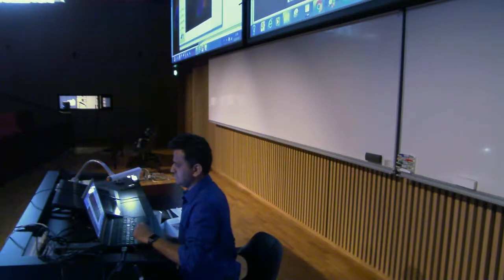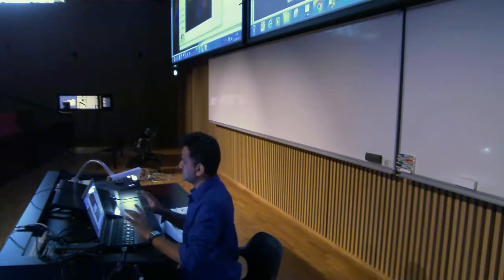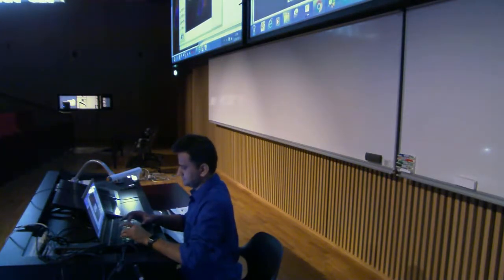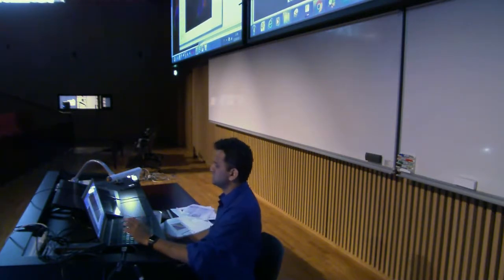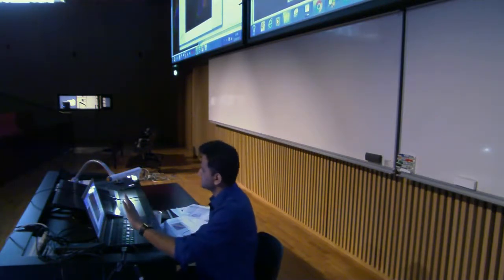So the green one, and then maybe create a new class. You can rename it also. Class 3, and I say green one here. Then you say train classifier. Sometimes it just gives a rubbish result, so you have to be very specific about what you're doing. But just for illustration, this should be enough.